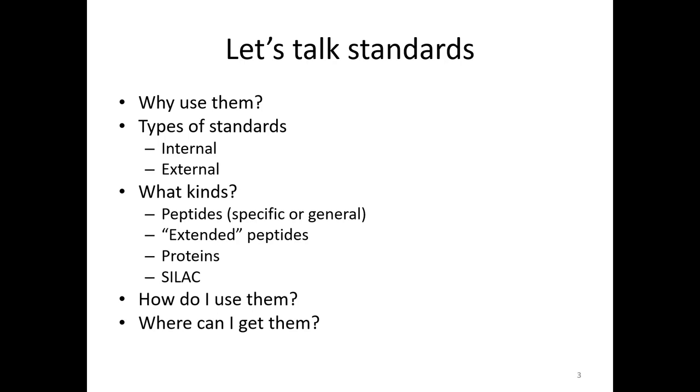These, I don't know if there's a proper name for them. If you want to actually digest rather than just have the peptide. Right, so it's the tryptic peptide synthesized with the additional amino acid sequence that's present in the protein, so that you spike the entire thing in, and trypsin can go in and cleave at the tryptic cleavage sites. So these tend to be synthesized longer, and we'll get into those in a minute.